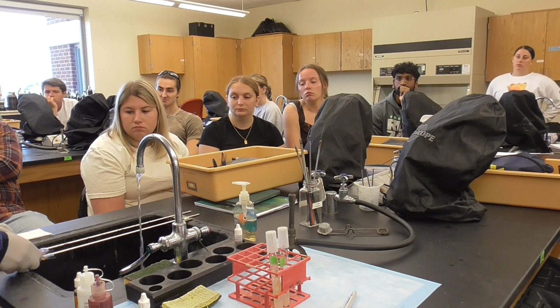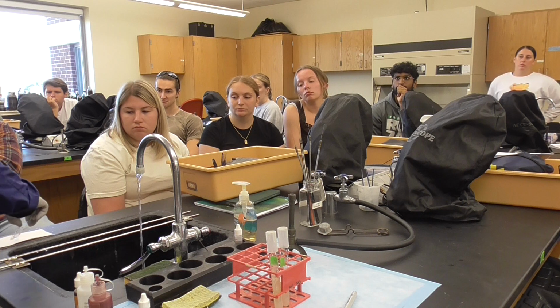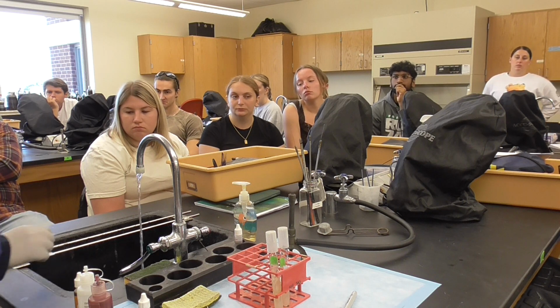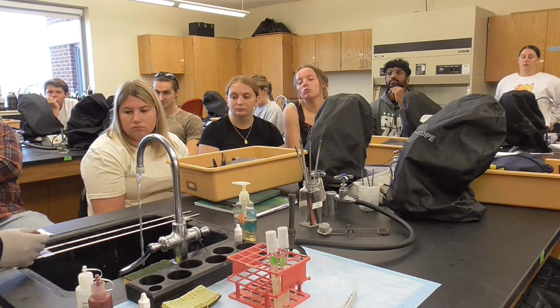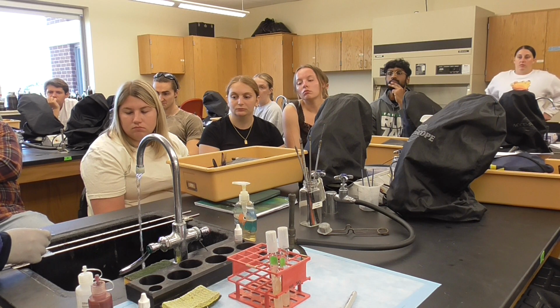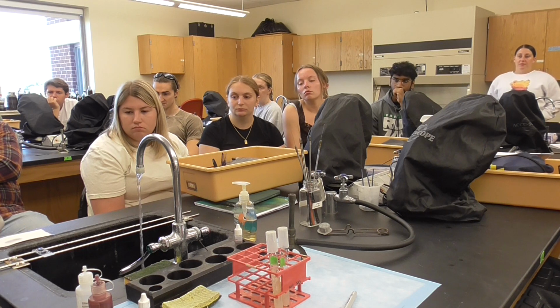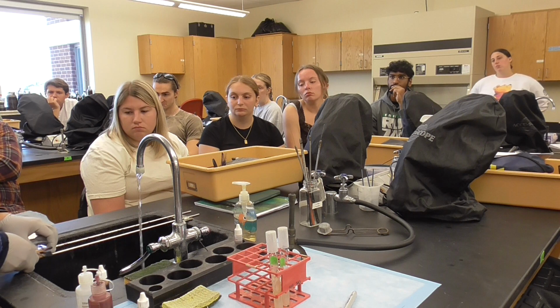Okay. The second thing we're going to do, drain the water a little bit like this. So we're going to do Gram iodine. The Gram iodine we put there to make sure the stain stays stronger. Iodine, let's say the 60 seconds is ready. So we're going to rinse it.